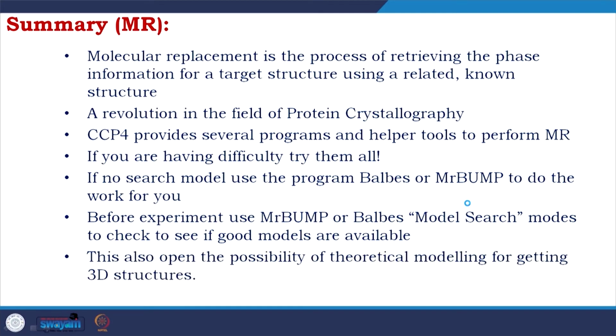And last but not the least, see a very interesting thing. We are talking about experiment, right? We are talking about X-ray crystallography and solving the phase problem. But if you look at what molecular replacement is doing, it is doing a threefold rotation followed by a threefold translation.